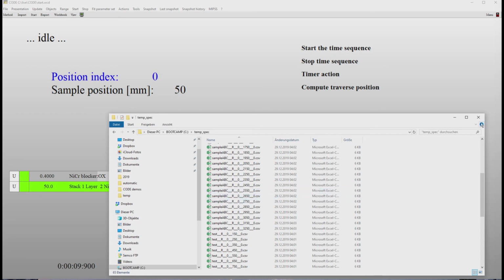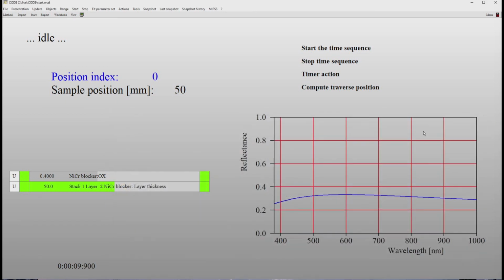So this tool now produces the spectra that I will need in another tutorial about what is called bulk analysis. That means the analysis of many spectra that are generated by measurement systems using parallel computing. That will be the next tutorial that I will develop during the next weeks, I hope.